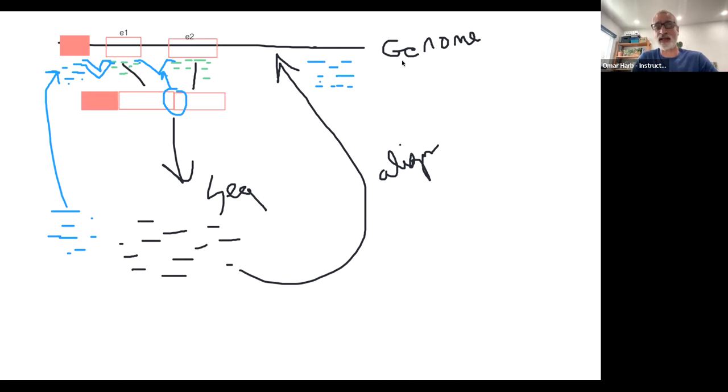Okay, so now from this RNA sequence data, we can get evidence of the expression of the gene, we can get evidence for splice junctions, we can get evidence for new genes, and we can get evidence for new potential alternative splice versions of a gene or exons.